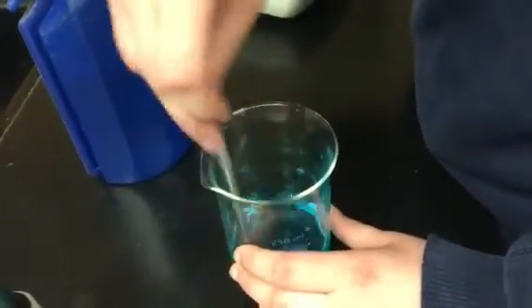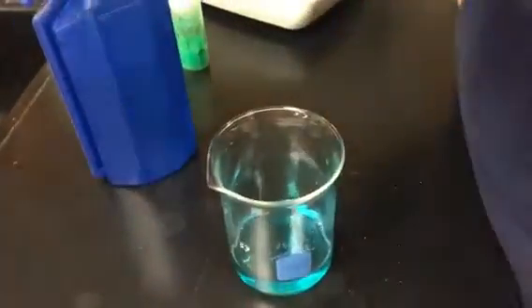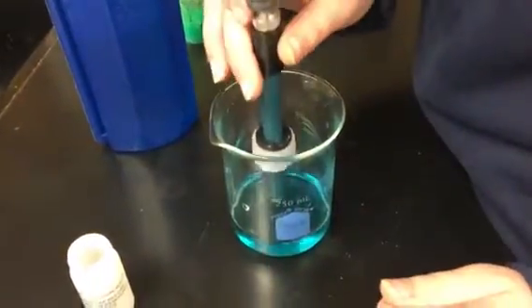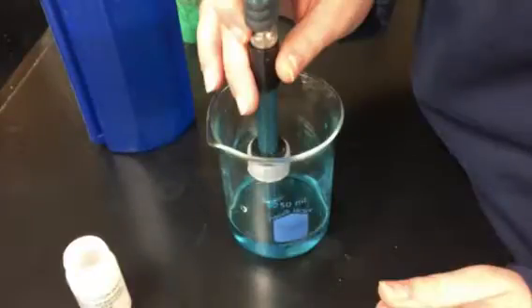As for the lab procedures, to conduct the lab, we had a Vernier pH probe that was Bluetooth connected to a school laptop that had a Vernier graphing program pulled up that recorded the pH data for each chloride. We got this Vernier program from the Vernier website. We used the number of grams of each chloride, as previously stated in the mass section. It was important that we got the exact number of grams in order to make an exact 5% solution.